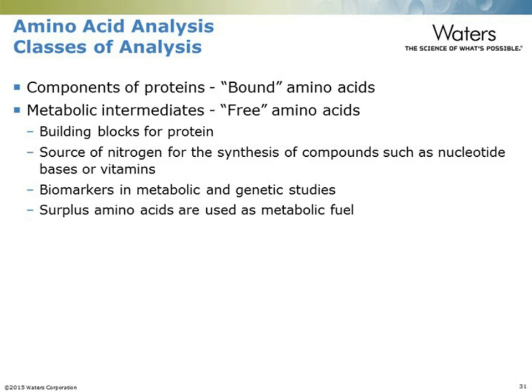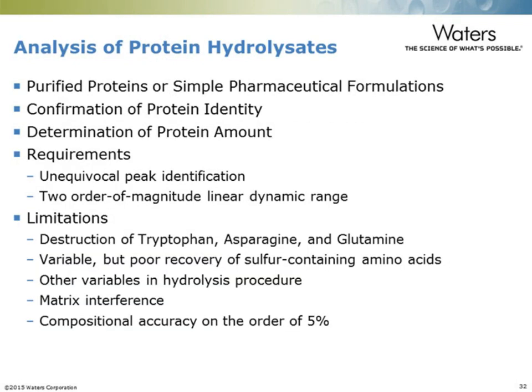Considering first the bound amino acids, we're looking here at a technique where the protein or peptide sample is hydrolyzed. We would use this to confirm the identity of the protein, to determine the amount. To successfully perform this analysis, we need to unequivocally identify the peak. We need something on the order of 2 orders of magnitude linear dynamic range, which would exceed the range that we would ever observe in a real protein sample.